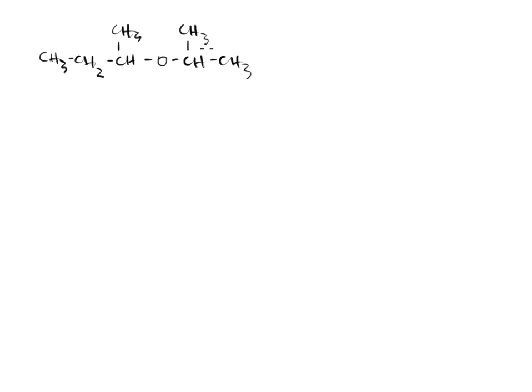Notice how I've drawn this time. I've really kind of showcased each bond between the carbons. And the reason I'm doing this is because it's going to help me explain what's getting ready to happen in the homolytic cleavage. So this molecule goes through the electron beam just as before. If it doesn't want to do hetero, then homo is an option for it to do. It's going to happen. There's no way around it. It's going to go this route. And we just need to figure out where these fragments or pieces are coming from.